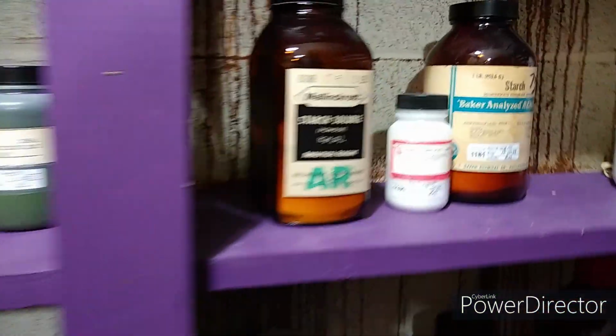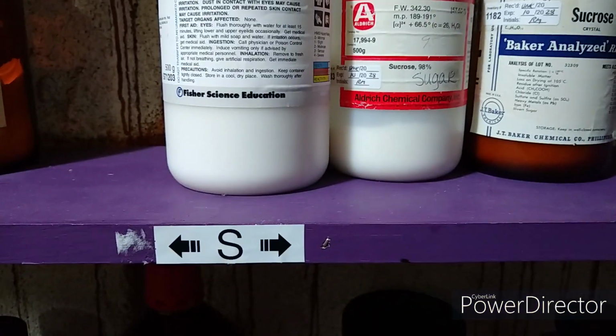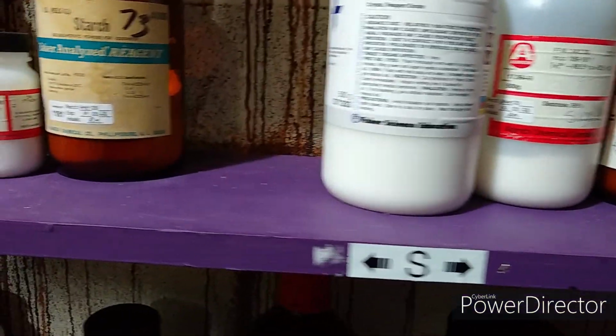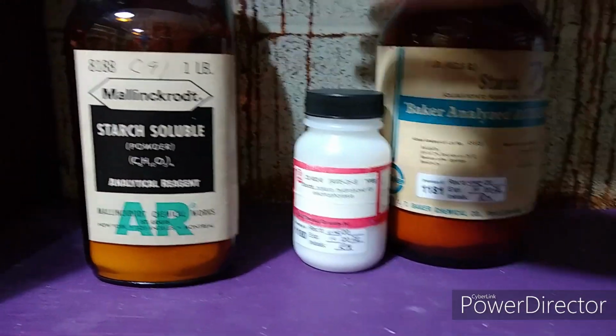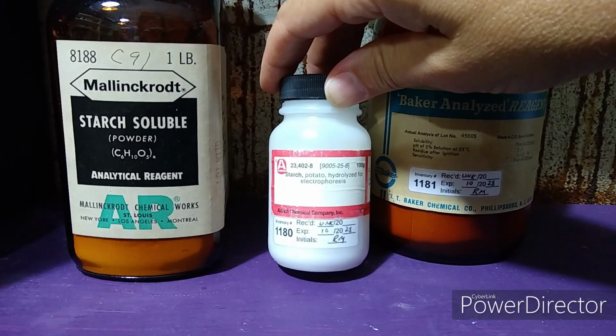M's. S's. That sounds like starch should be around here. Sucrose. I don't need sucrose. Here's some starch. And different kinds of starch here. I think I've been using this starch potato.